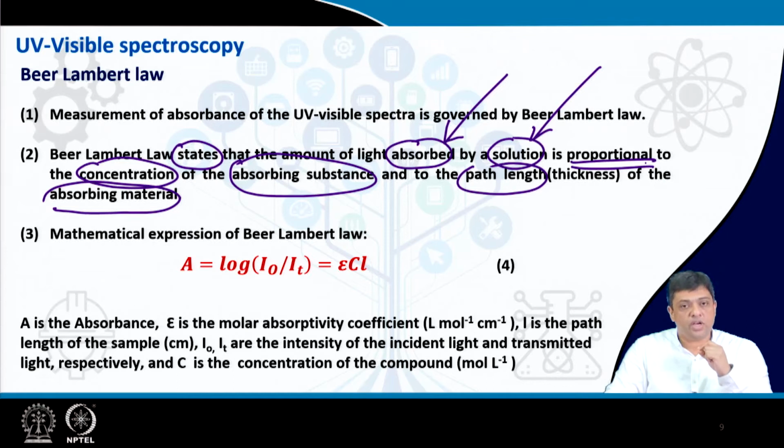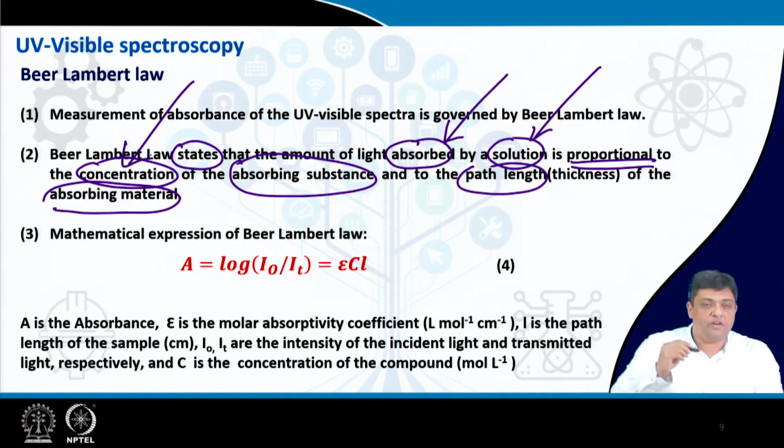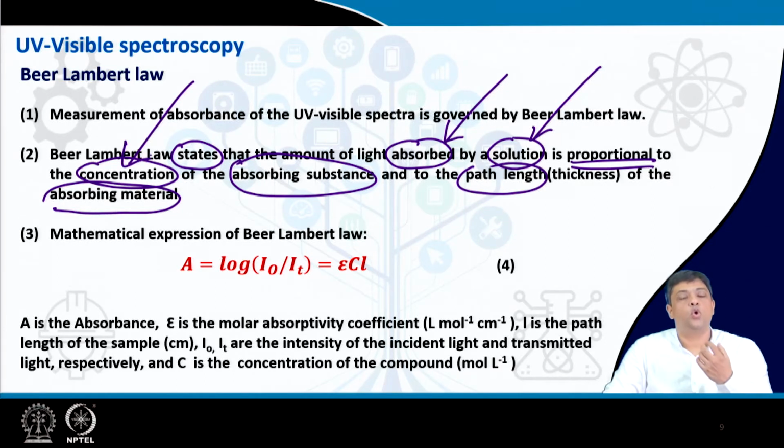So, the concentration of the absorbing substance, the substance which will absorb the energy from the incident UV light.